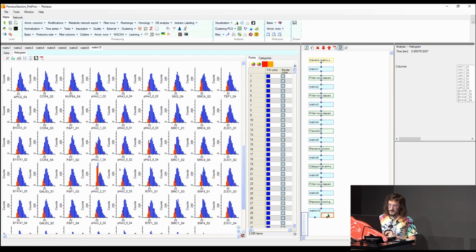But then we have this data here, this specific histone protein that was marked. Well, this looks very bad. So I will definitely remove something that looks like that. And also we know that it's just one of the many controls there were, so we're not going to lose very much information.